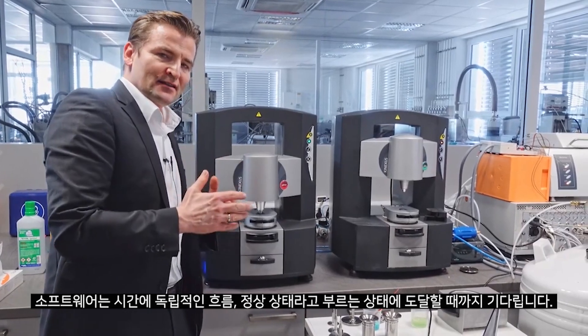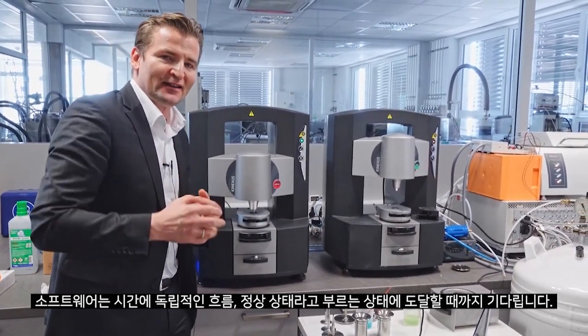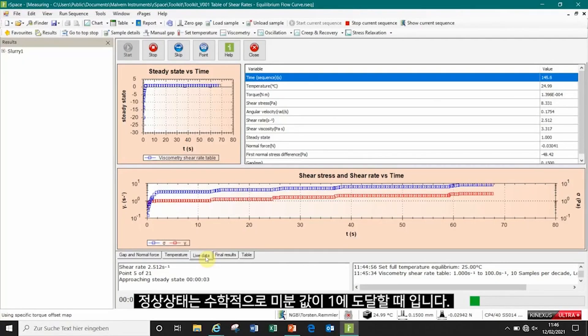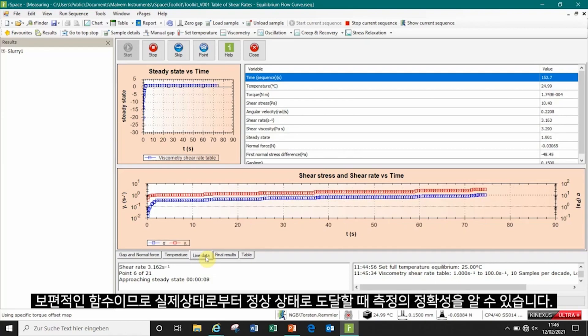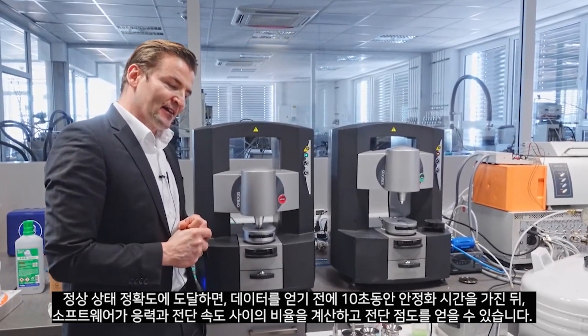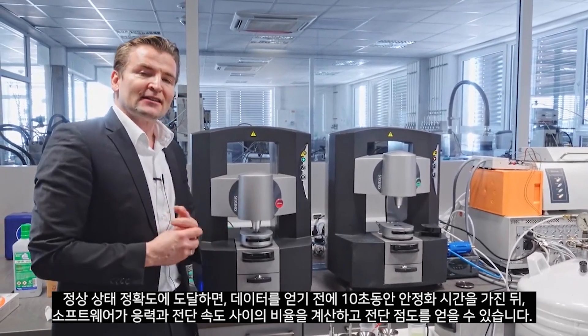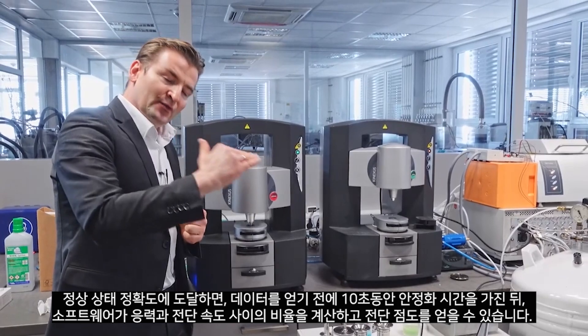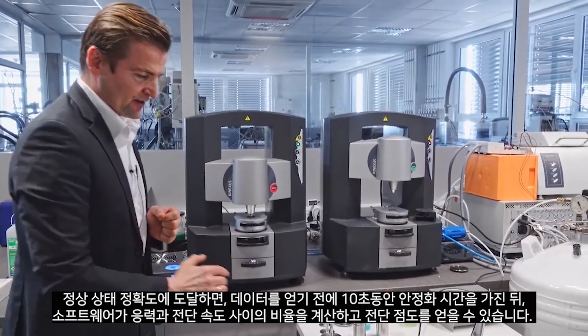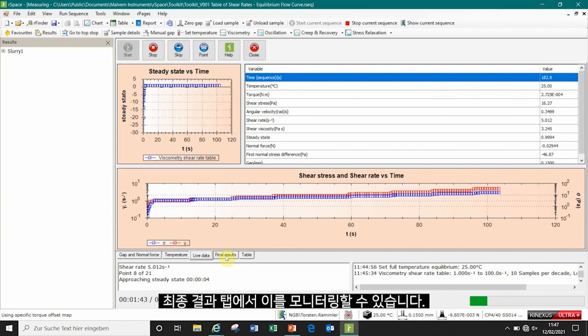The software automatically waits as long as needed to reach time-independent flow. We call this steady state, and it is determined by a mathematical derivative which reaches a value of 1 independent of the sample and independent of the viscosity function — it's a universal function showing how accurately we are measuring. An integration time of 10 seconds is then averaged before the data is analyzed. The software calculates the ratio between the stress and the shear rate, giving us our shear viscosity curve, which we can monitor in the final results tab.